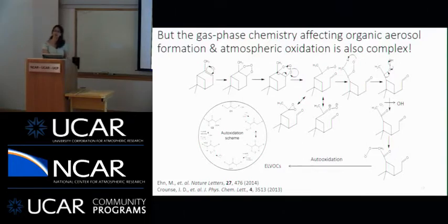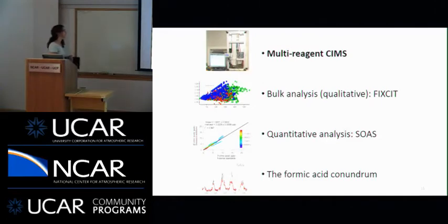Classically, a lot of atmospheric chemistry has been done with spectroscopy techniques, but those are actually quite limited in terms of being able to quantify and identify large numbers of very different molecules. So what we're really trying to do is think about something that we're calling multi-reagent chemical ionization mass spectrometry, or switchable reagent ion mass spectrometry, one where we can take advantage of mass spec's ability to measure large numbers of molecules at effectively the same time, and one that allows us to control what type of chemistry we measure.